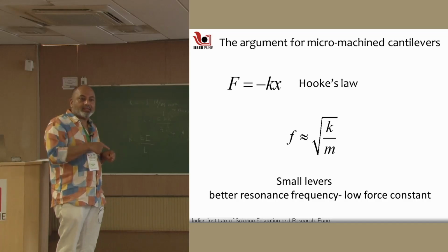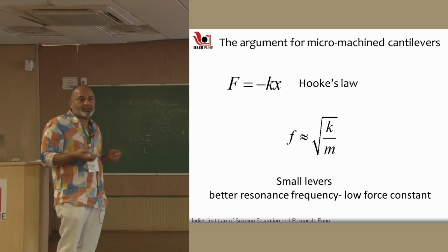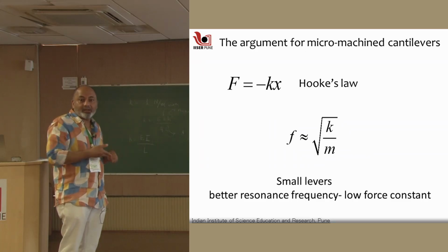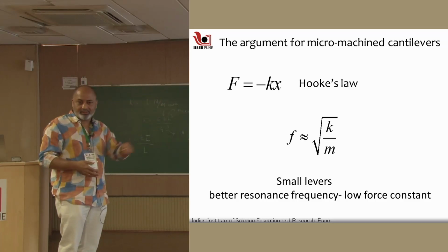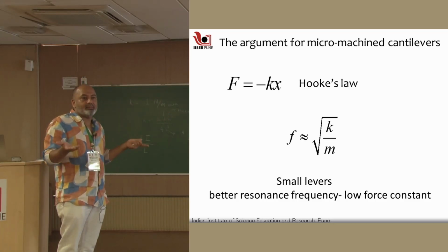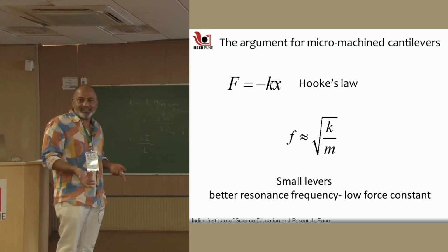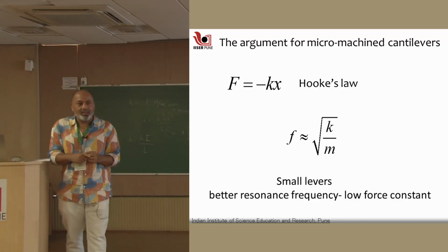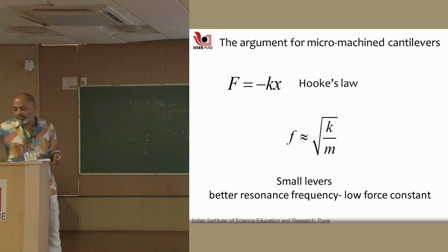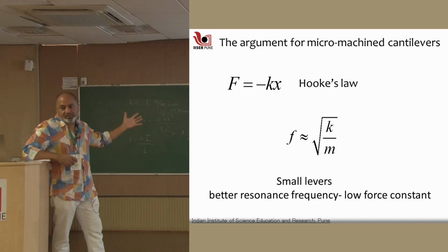The whole line scan, if I do 256 points, which is normally what digital cards do, or 512 points, takes 500 seconds for one line, and then you do 500 such lines on the other side. So, that means 512 into 512 seconds, that is basically your entire PhD time, okay, maybe. So, this is extremely slow, and this happens because the cantilever's response time has gone down because there is too much inertia, too much mass on the cantilever.